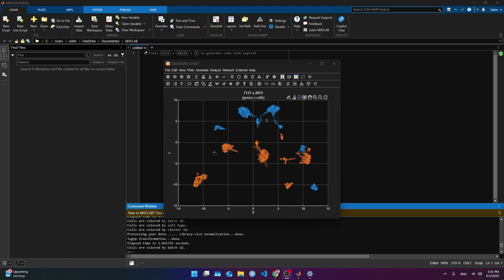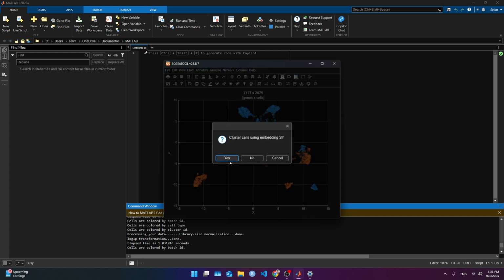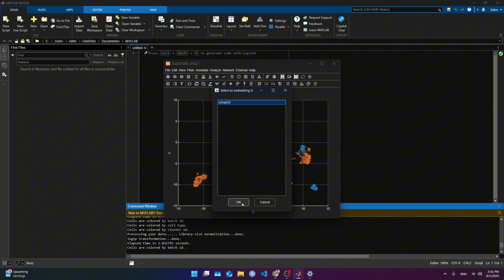All right, I found it. The next button is to find the clusters. The clusters are gonna try to classify the cells by vicinities in algorithms. Those I'm not gonna talk about in depth, but we'll have a grasp later. What this is doing here is this button, clustering using cell embedding. So this is the k-means and relies on the UMAP representation. For now, we're gonna use this, but I have another algorithm that we are going to use later.